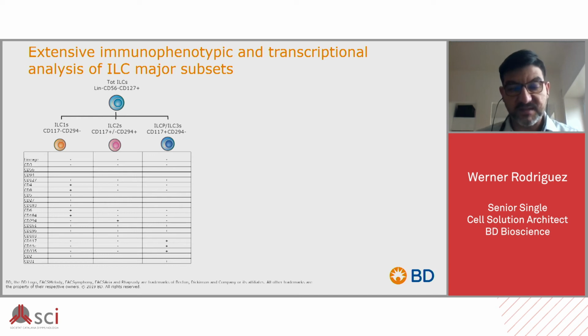And we saw that there are some positive expressions, for example, of CD4, which is a classical marker for T cells.